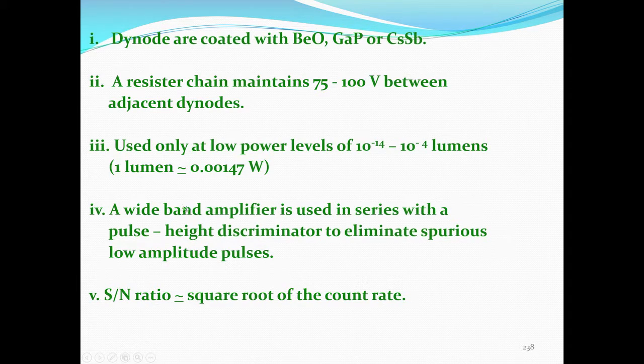So, you can calculate from this figure what would be the lumen component. If I tell you 3 watt bulb, you can always calculate what would be the lumens.